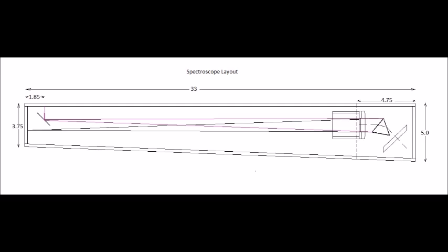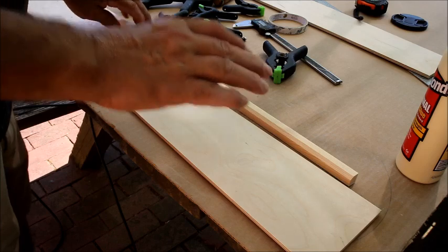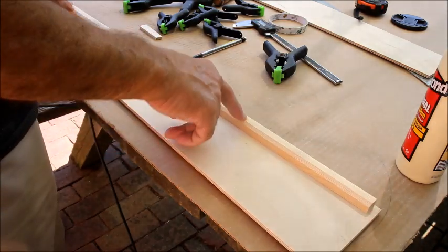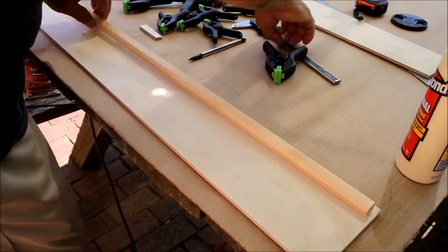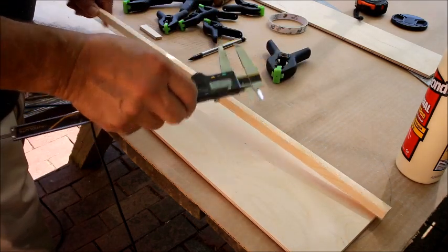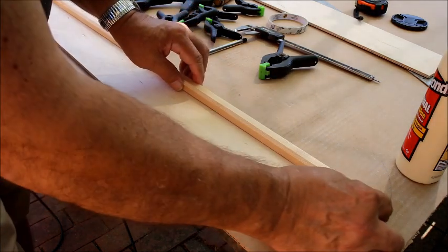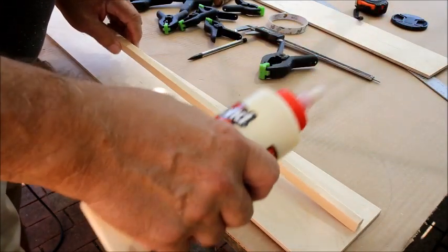I couldn't find quarter-inch Baltic birch locally, so it was ordered online. I cut two sides 33 inches long by 3.75 inches on one end and 5 inches on the other end, slightly oversized. Be sure to keep the good side out. I taped them together with 3 inches of two-sided tape on each end and brought them down to finish size together so they were both identical. I then glued a rib on it — I ripped it on the table saw to 0.5-eighth square and cut the length to 32.5 inches, leaving room for a little piece of Baltic birch all the way around.